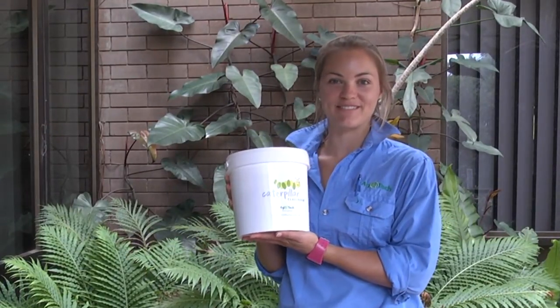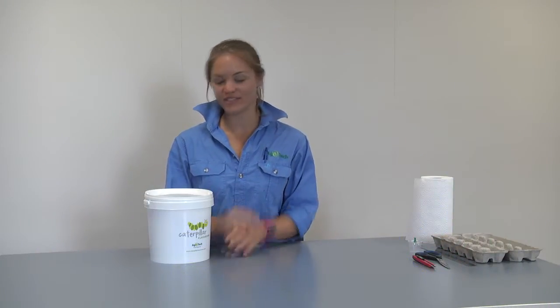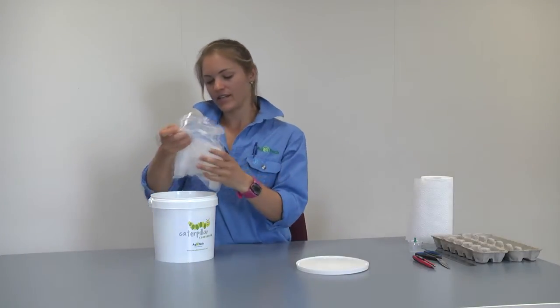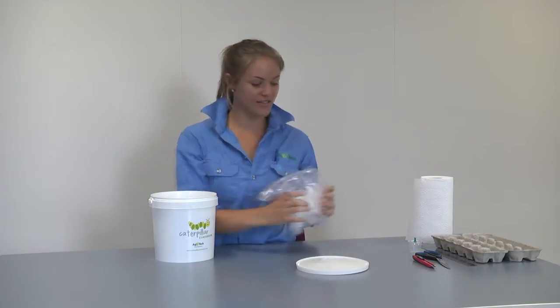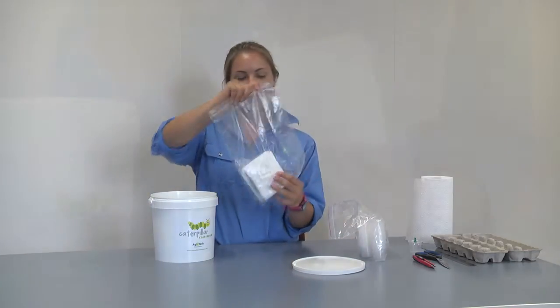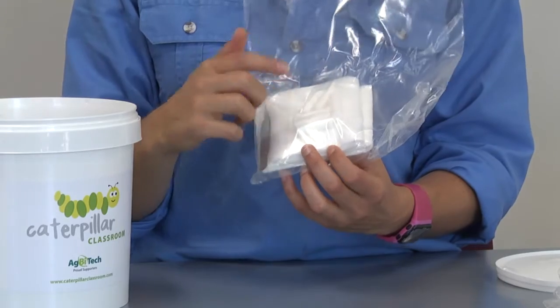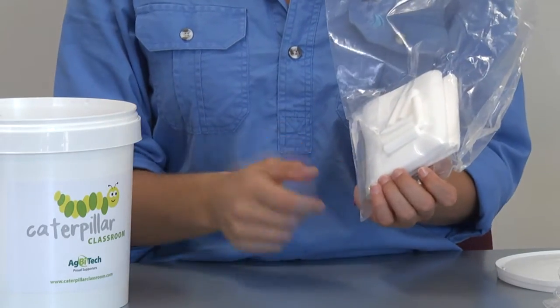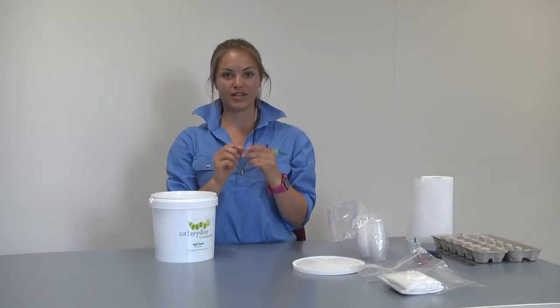Now that your Helicoverpa rearing kit has arrived, open it up and inside you will find some rearing cups and lids, around four per student. Inside this zip-lock bag you will find nappy liners, some cotton dental roll, some paper towel, and a pair of featherlight forceps.